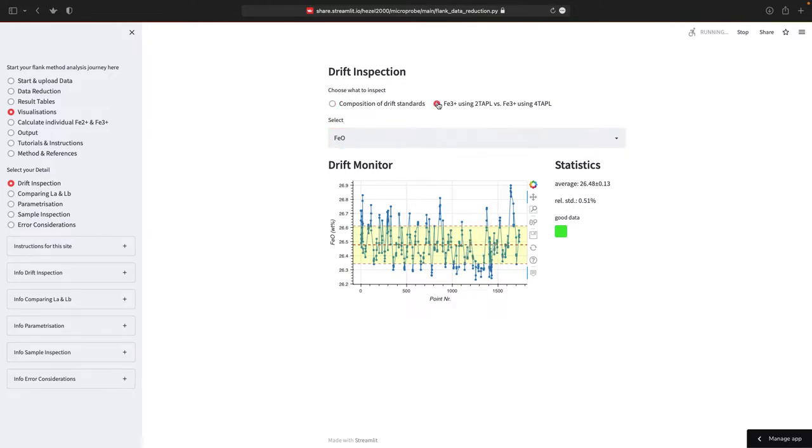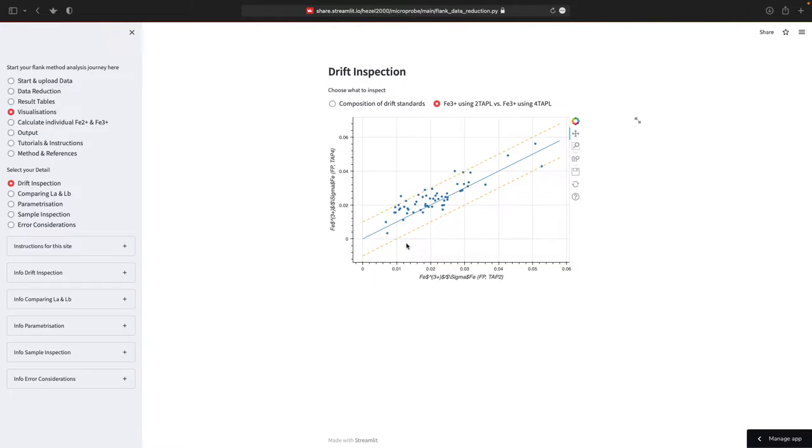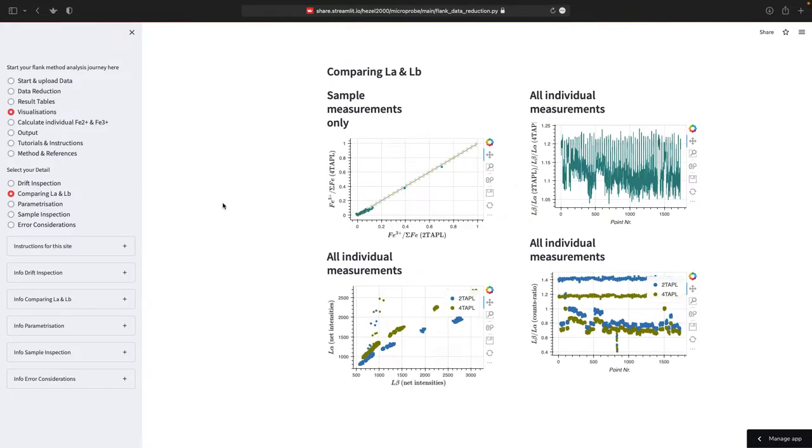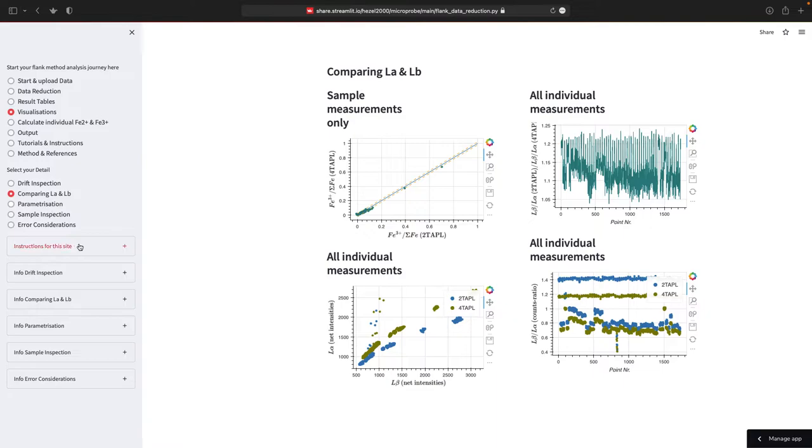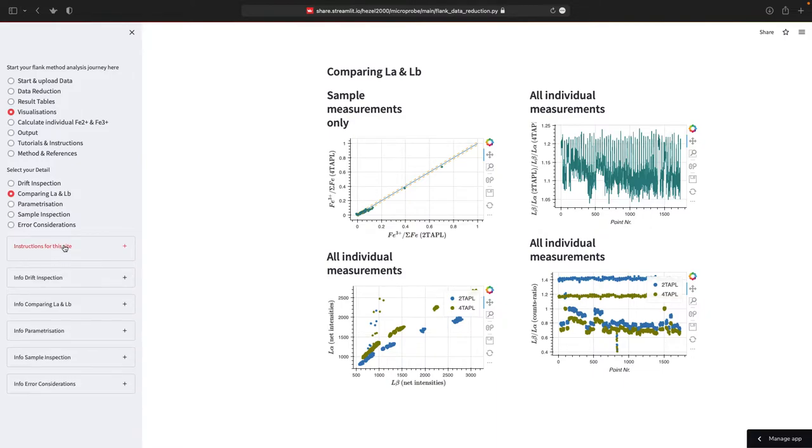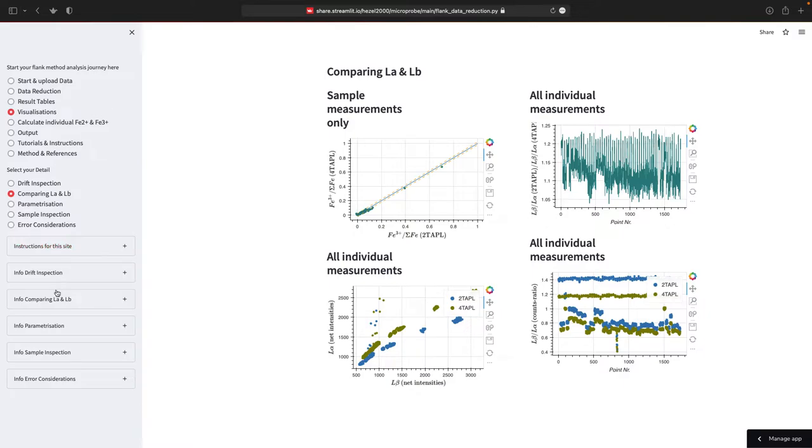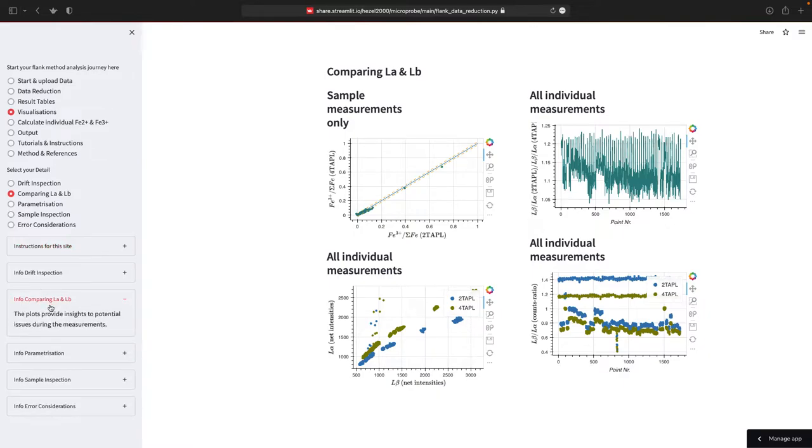You can also check on how the iron 3+ calculated from tap 2 and tap 4 compare to each other. Ideally, this should more or less plot on a slope 1 line, I guess. Then you can go to comparing L alpha and L beta. This is really just to have some impression. I'm not going into detail here. This should be more or less self-explanatory. If not, there is instructions for the site. There's information about L alpha and L beta.